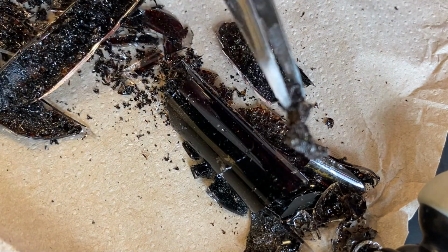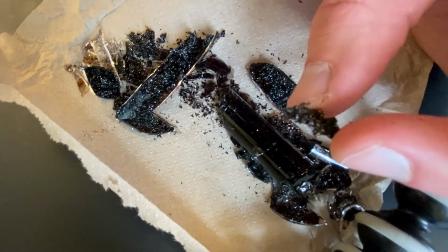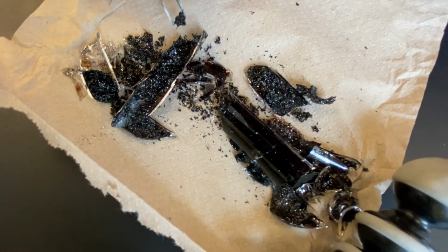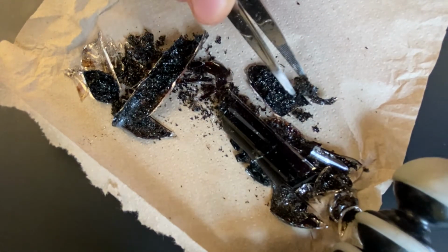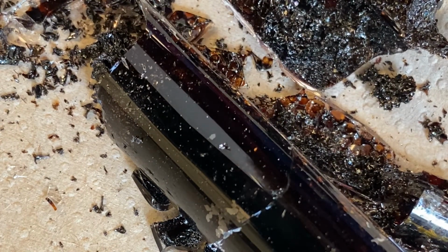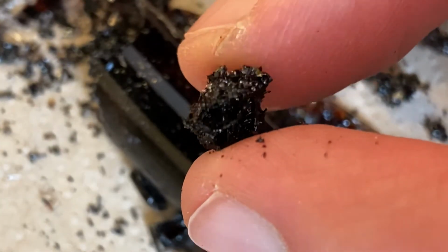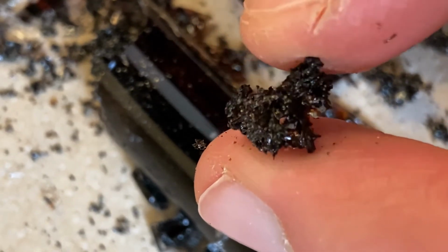Okay. There is a larger piece. Okay, so this stuff is a very, very dark brown, nearly black in color. But it's shiny, it's not dull, right? It has some pieces that are reflecting light. You can see, whoopsies, boy, it's really hard to hold on to with these forceps. I'll do my finger, okay? As I turn it, you can see that there are some crystals in there that reflect light, okay? So it's not completely dull.